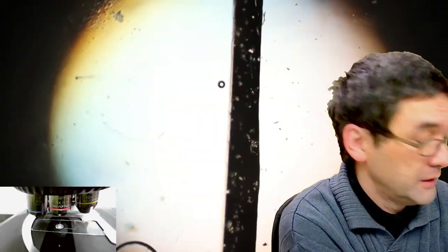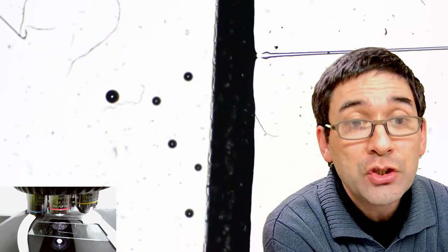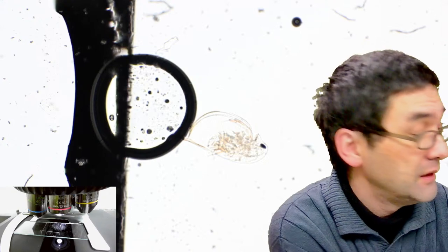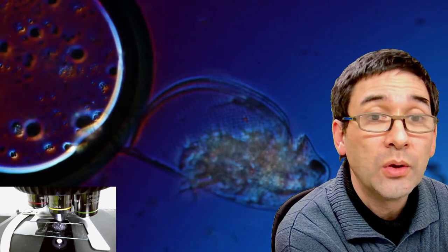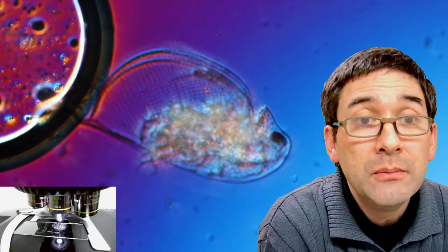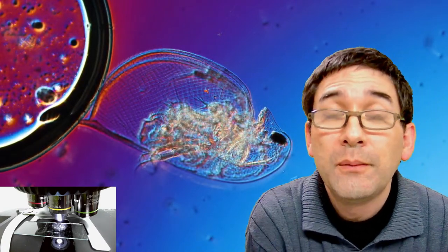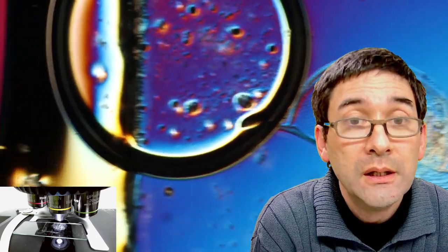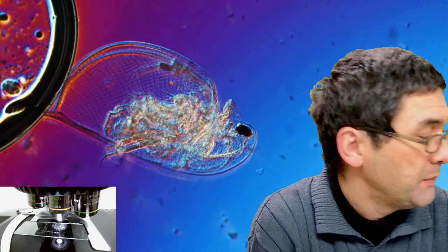There were not a lot of them, but there were some, especially on the side — some Artemia brine shrimp and I have to find them. The drying process actually was not very good. That's the water flea one. For the water flea it did seem to work a little bit, but not for the brine shrimp. What you see here is one of the Daphnia basically in this glue mounting medium. We can see that because of the relatively hard exoskeleton, the shape was still maintained.